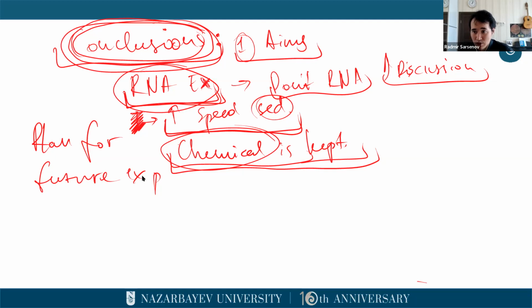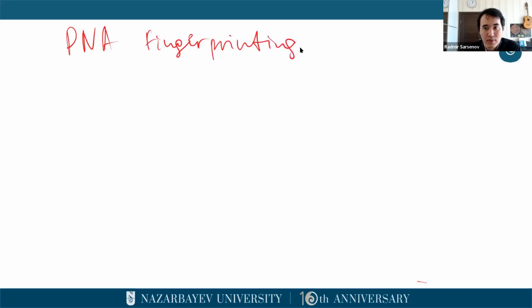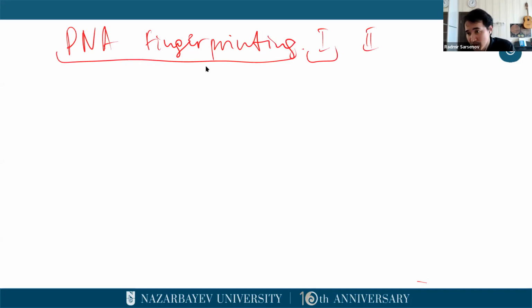Okay, so these are sections that are showing you why it is important to keep the Labbook. Okay, so let's say that you have an educational lab and it is being divided onto 2 weeks. So we will have DNA fingerprinting. So DNA fingerprinting is actually divided onto 2 weeks. So first week we perform the experiment itself, and the second week we obtain the results and we analyze them.